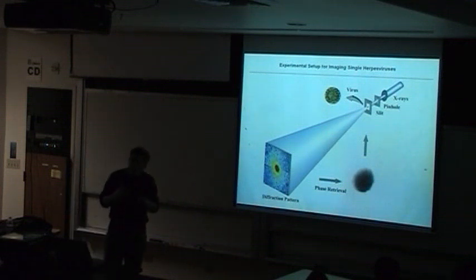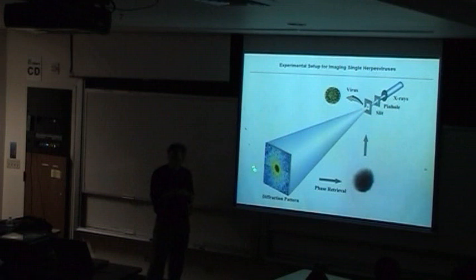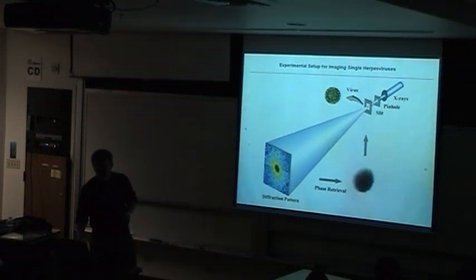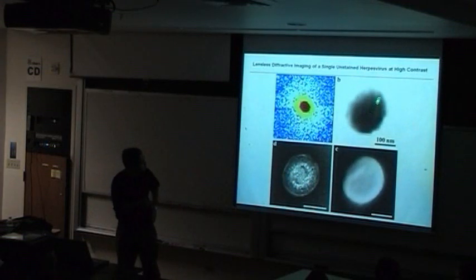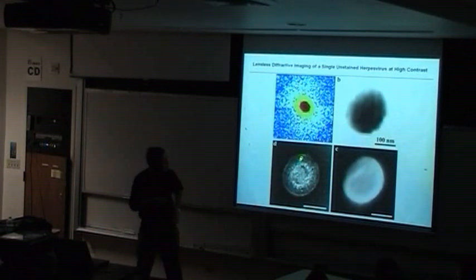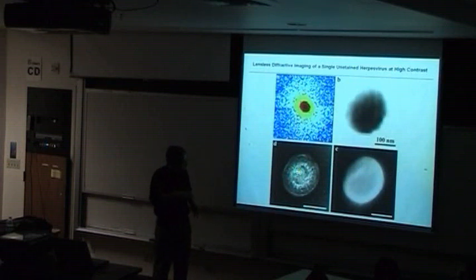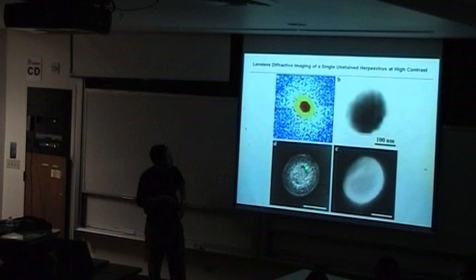Now, fortunately for our technique, as I said, our DC term is not included, so everything comes from the signal. There's no DC term, so the contrast of the technique is quite good. Here it shows the high contrast, and this is our reconstruction. This is an SEM image of the same sample, and this is negative stained TEM. For negative staining they use a high Z element.